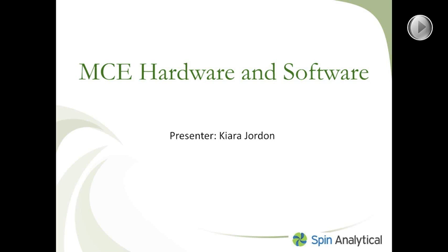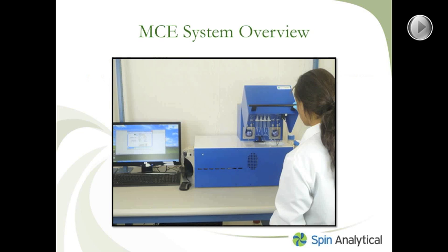On the right-hand side, you can see we have the MCE instrument — that's what it looks like, the blue rectangular box. With the instrument comes a computer to operate the software. You also have a cell assembly, but that's not shown in this image.